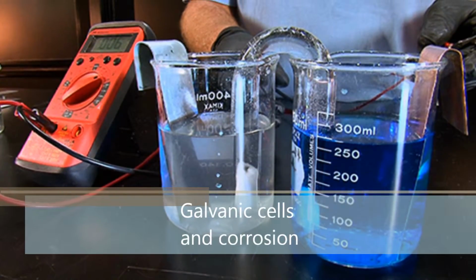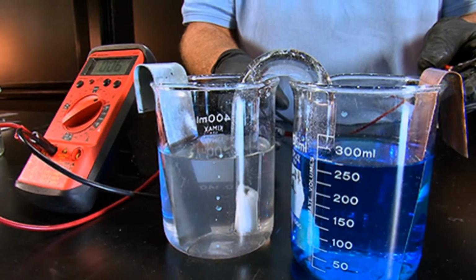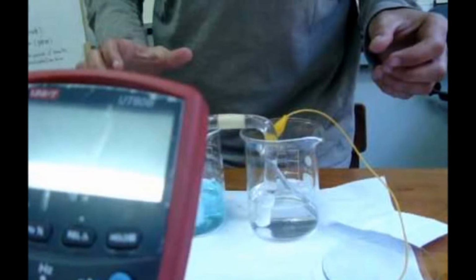Galvanic cells and corrosion. The experiment consists of making a galvanic cell with different compounds to observe how the redox reaction becomes spontaneous, creating a flow of electrons, and observing how different galvanic cells create different voltage.